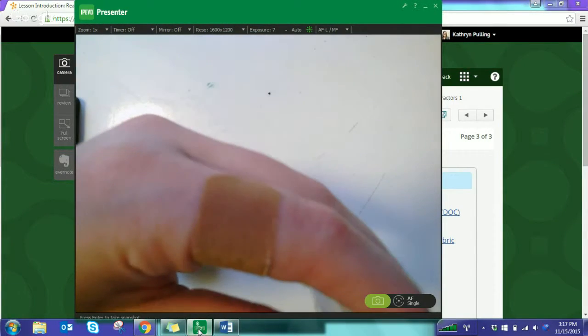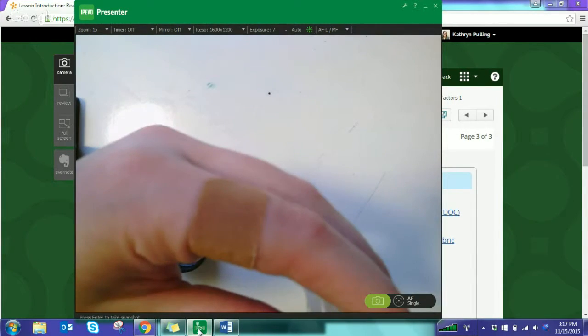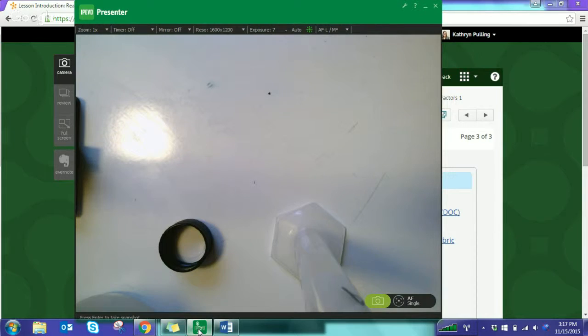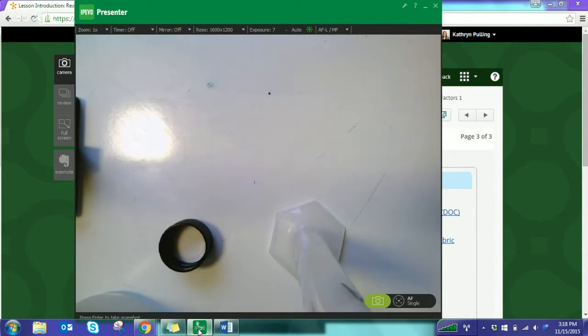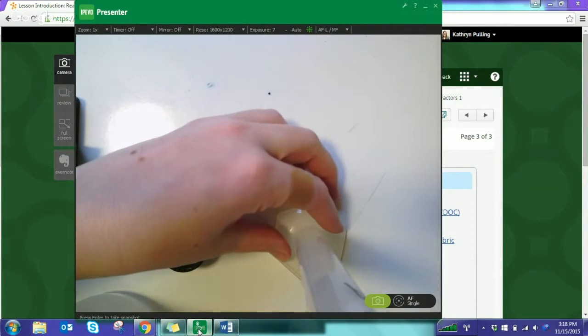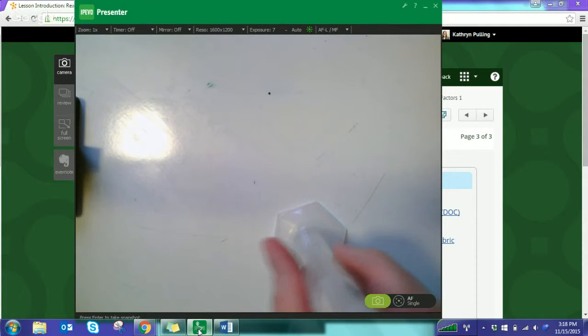Again, if you spill anything, if you get it on yourself, rinse yourself off right away. We're almost there. If you remember with the graduated cylinder, there's not too much of a meniscus on plastic, but the bottom of the meniscus or the bottom of the curve has to be at your 20 mark. Okay, so A has been measured. I'm putting my cap back on. I'm just going to set this graduated cylinder off to the side until I have B and C prepared as well. So B, the table says 10 milliliters.